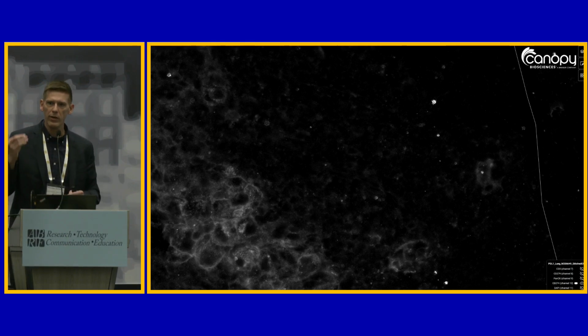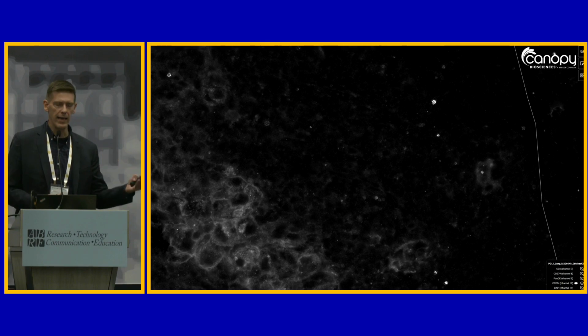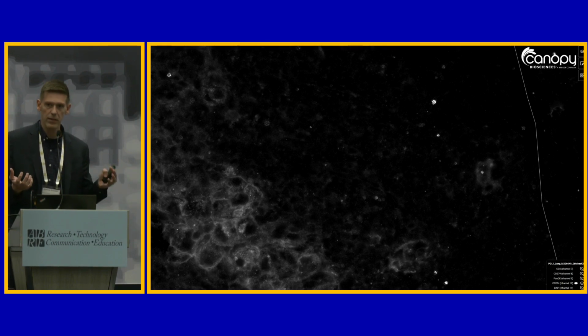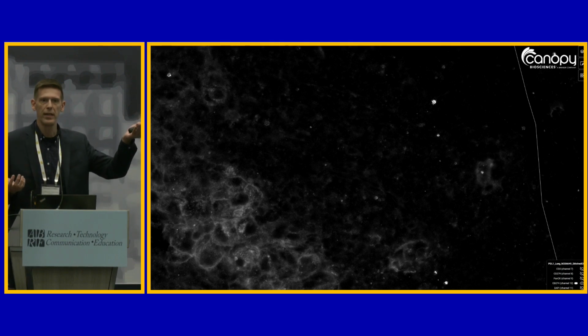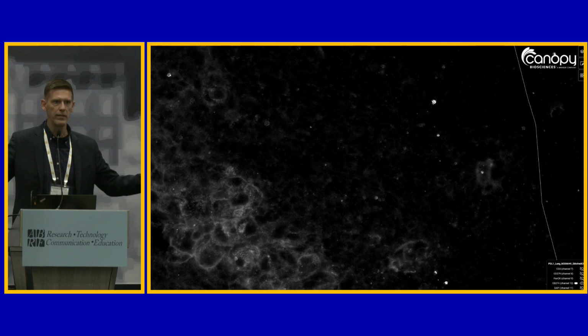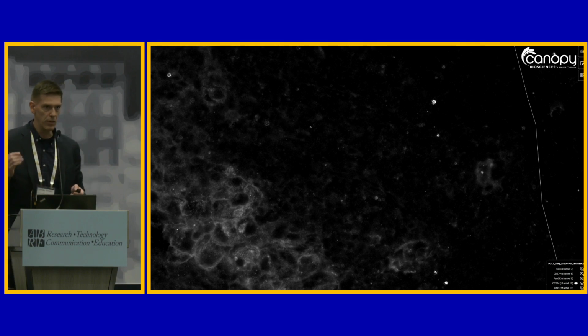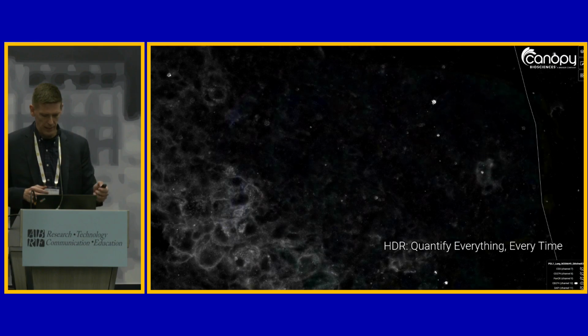The thing is, PD-L1 is expressed on basically anything that comes out of bone marrow. So it's not necessarily binary, whether it has the signal or it isn't. It's rather, is that signal that we're seeing outside of the endogenous expression that I would necessarily expect? That's where you need HDR imaging, because we need to be able to collect on a linear scale all that data in order to measure those two one against the other. So that's an example where HDR actually does do you a specific benefit. It allows you access to something that you wouldn't otherwise have.